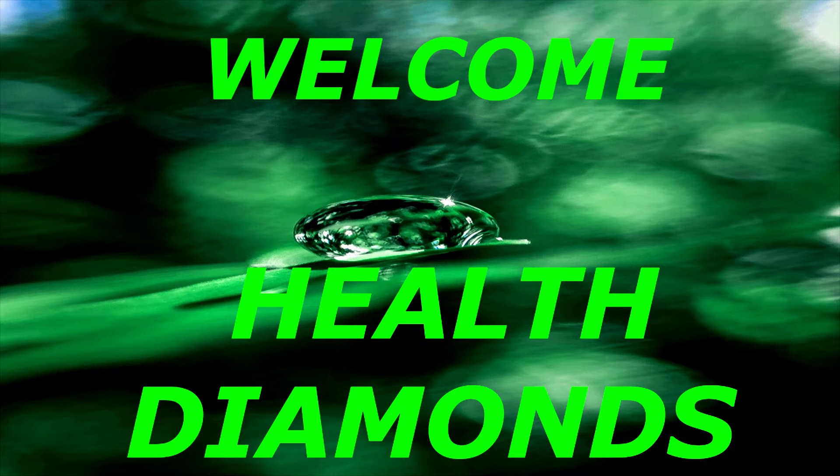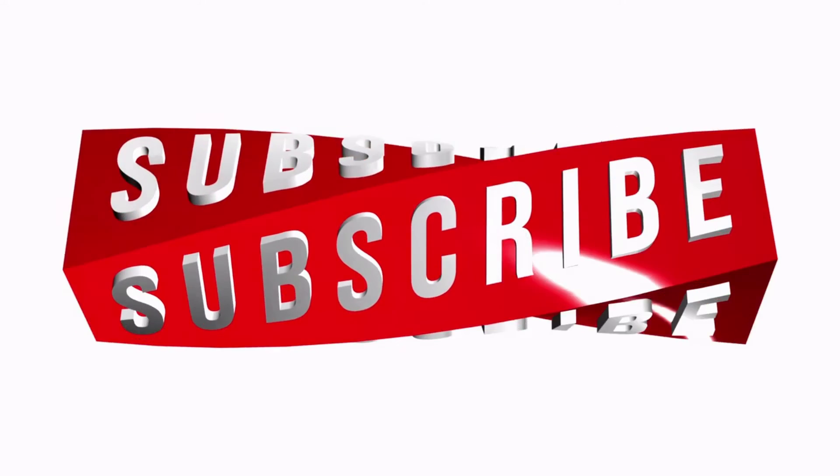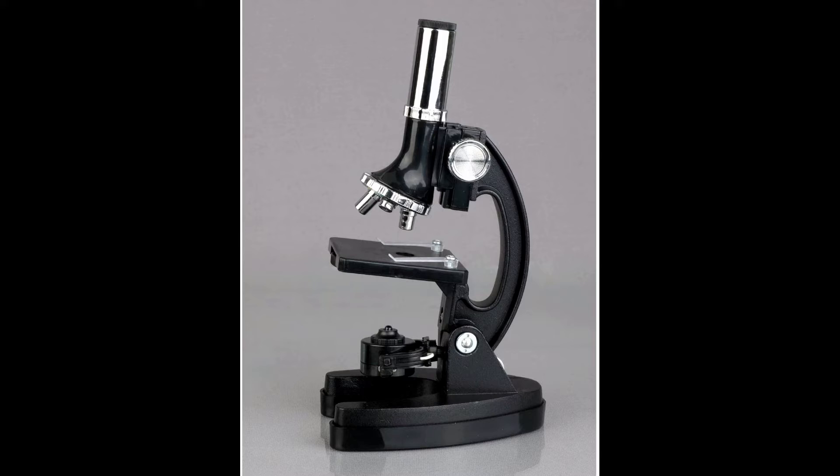Welcome to my YouTube channel Health Diamonds. M Scope 120x1200x 52pcs Kids Beginner Microscope Stem Kit with Metal Body Microscope, Plastic Slides, Lead Light and Carrying Box, M30ABS KT51, Black. About this item: 120x, 240x, 300x, 480x, 600x, 1200x magnifications, Beginner Microscope with Durable Metal Construction Frame with Stage and Clips.